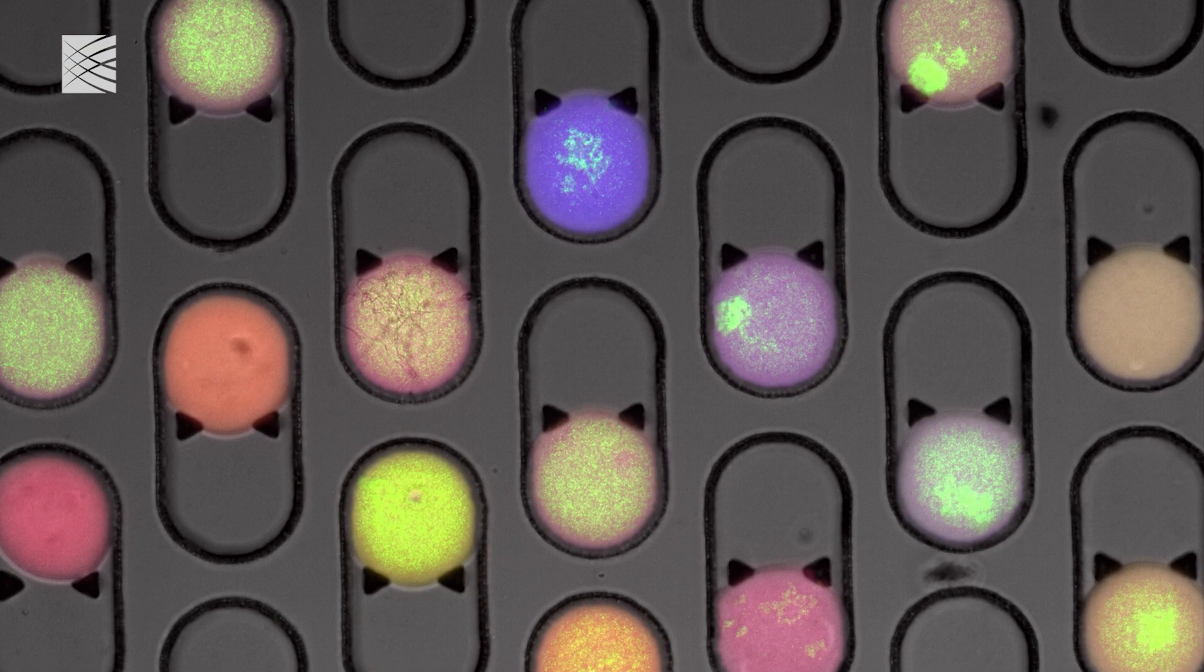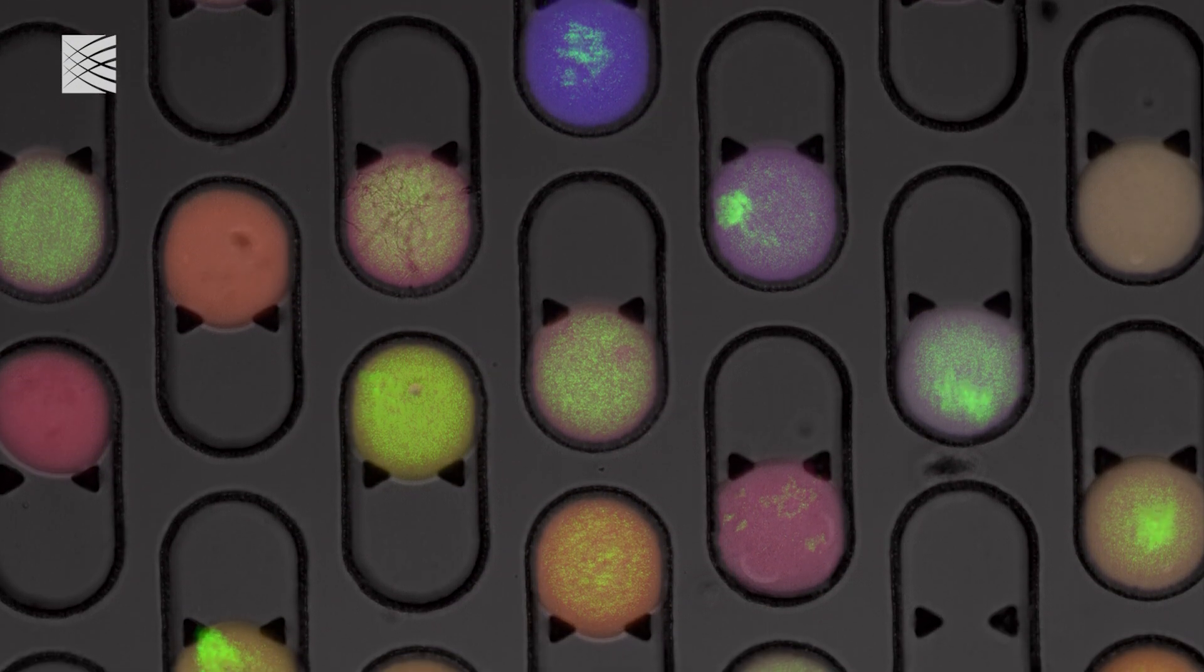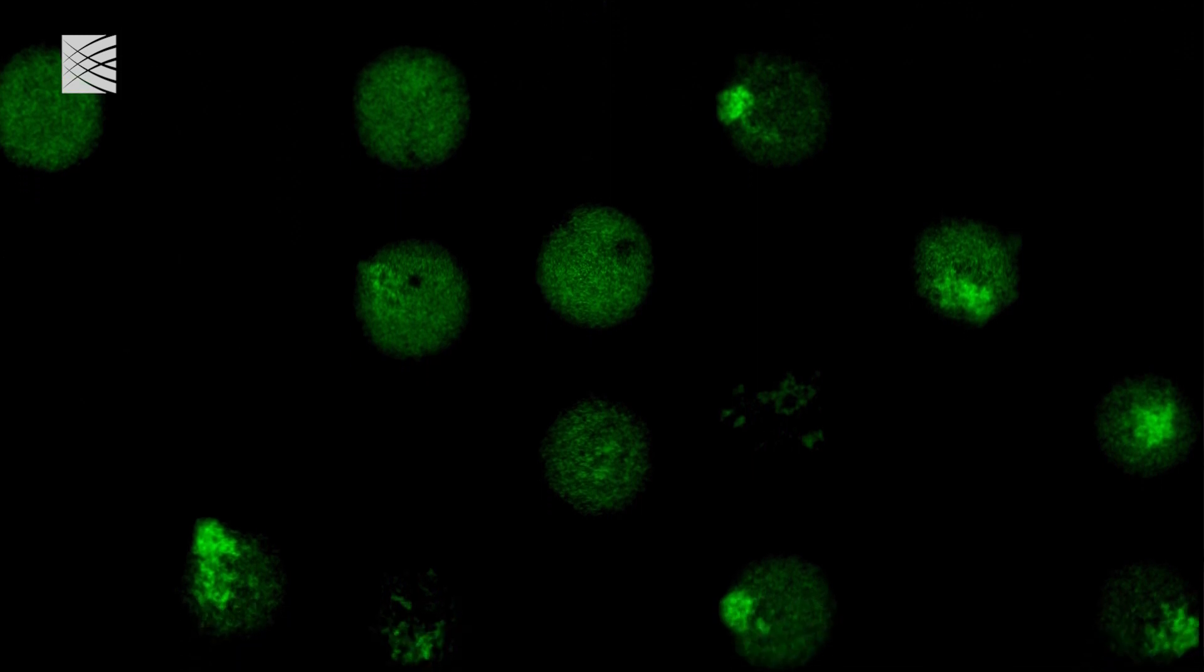For our first full-scale test, we screened 10 antibiotics against more than 4,000 compounds from the Broad Institute's Drug Repurposing Library. This library is a collection of compounds that are in development or clinical use for other diseases. After just 10 days of testing against E. coli, we discovered more than 10 promising combinations for further study.